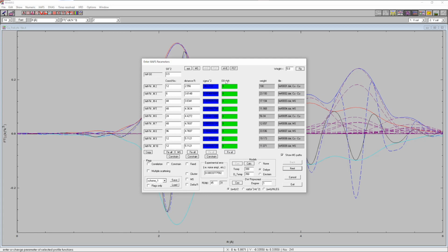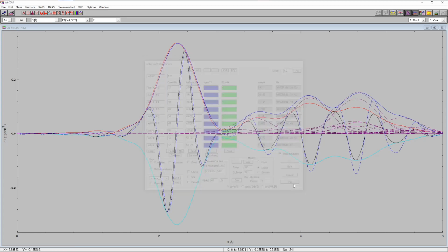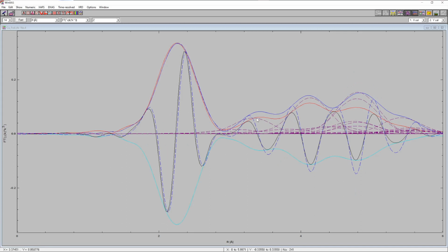So going back to the regular calculation, and let's see what else is available now to obtain a better agreement in amplitude. In particular, the agreement in the imaginary part is already quite good, definitely sufficient for starting the refinement, but the agreement in the amplitude is still poor, and we want to improve that.